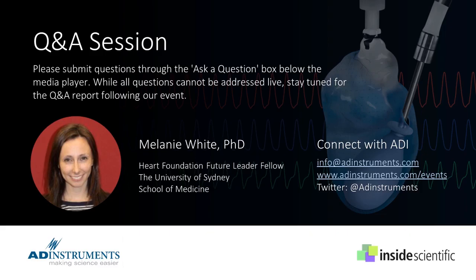My background isn't so much in blood gases, but as I discussed, especially with things like lactate, because lactate will ultimately change the extracellular pH, if we don't wash that away, that has the ability to create a metabolic acidosis situation, and that has the ability to really significantly influence how the heart perfuses on the Langendorff system. So considering that we're aiming for a physiological pH of 7.4, if we have too much lactate in our system, that's going to significantly drop that pH, and that's going to influence things like the force of contracture, but also the heart rate as well.